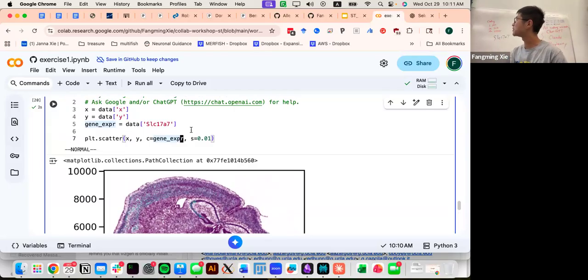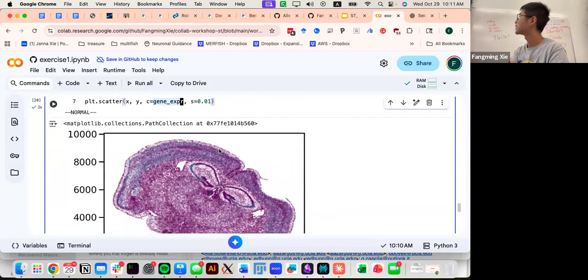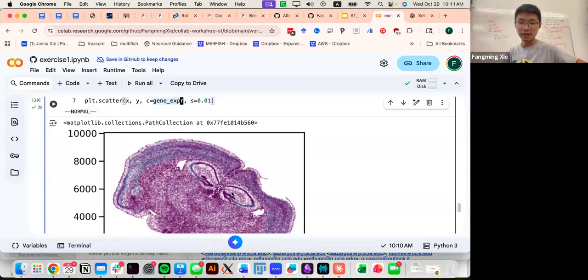You probably have a few extreme values. For example, the gene expression. If there's only a few cells that have extremely high values of expression, but most others have smaller values, then you won't be able to see the patterns of the variation among the majority of cells.